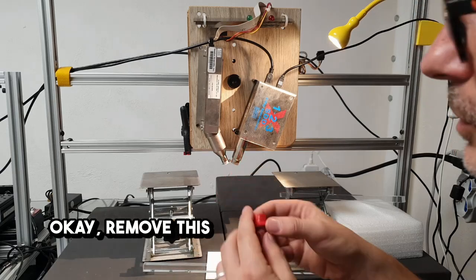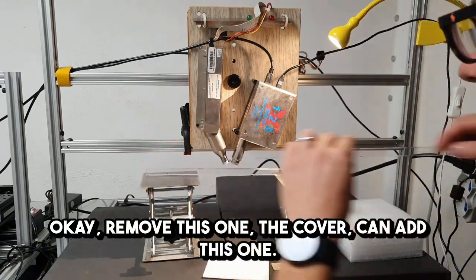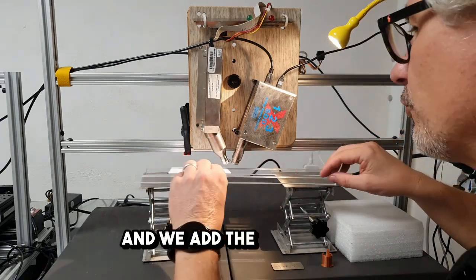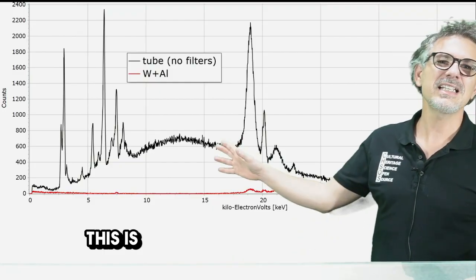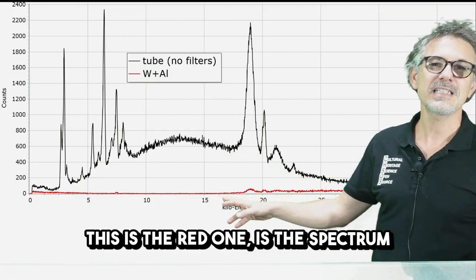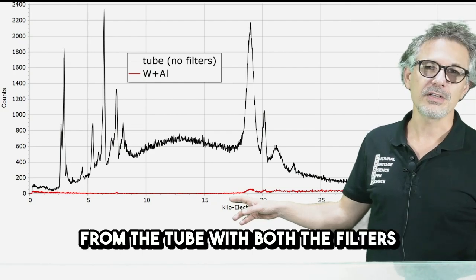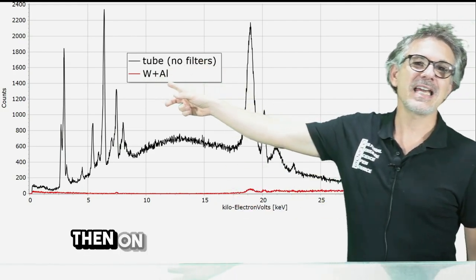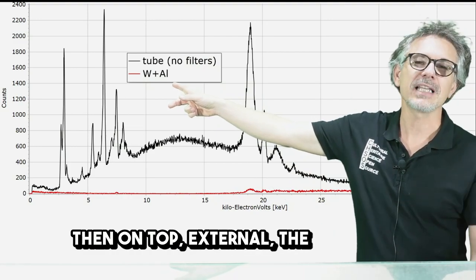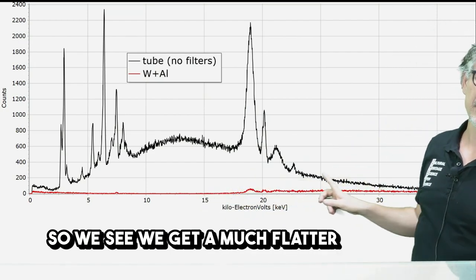Okay, remove this one, the cover. You can have this one, and we add the reflector. Let's measure it. There it is. The red one is the spectrum from the tube with both the filters. First the tungsten over here, and then on top, external, the aluminum. So we see we get a much flatter spectrum.